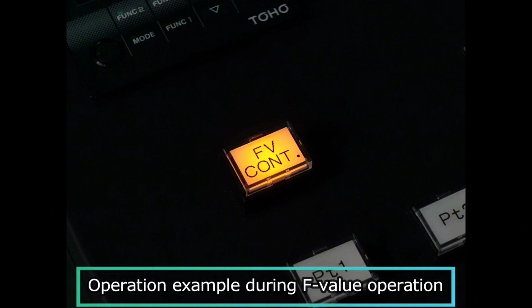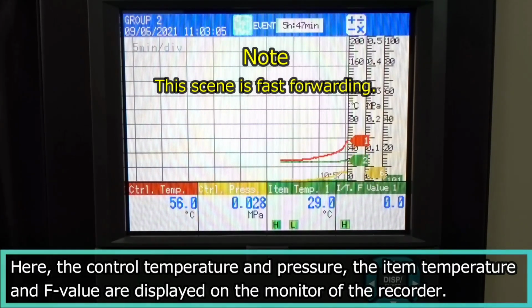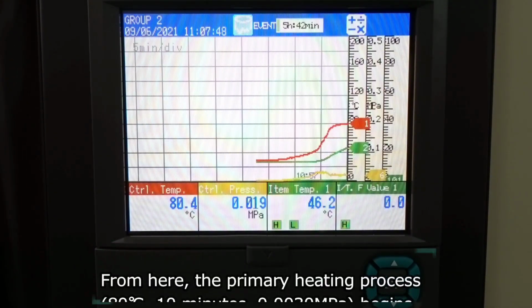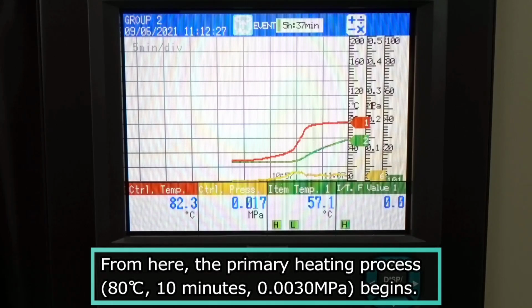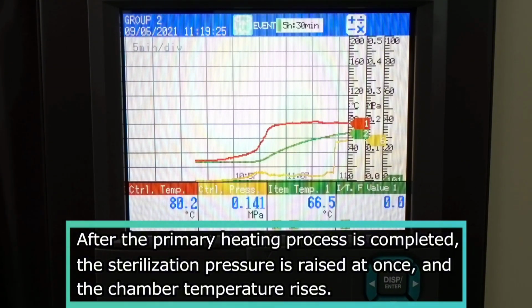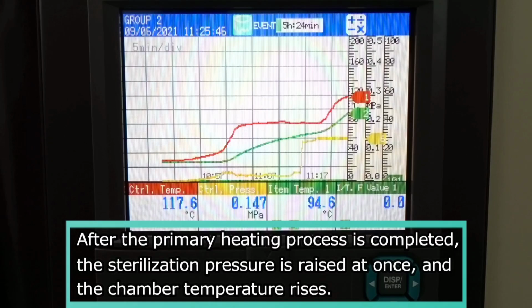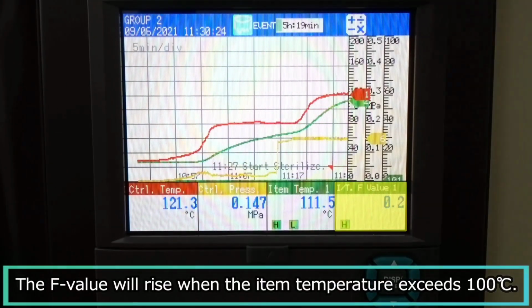Operation example during F-value operation. Here, the control temperature and pressure, the item temperature and F-value are displayed on the monitor of the recorder. The item temperature will rise over time. From here, the primary heating process, 80 degrees Celsius, 10 minutes, 0.003 megapascals, begins. After the primary heating process is completed, the sterilization pressure is raised at once, and the chamber temperature rises. The F-value will rise when the item temperature exceeds 100 degrees Celsius.